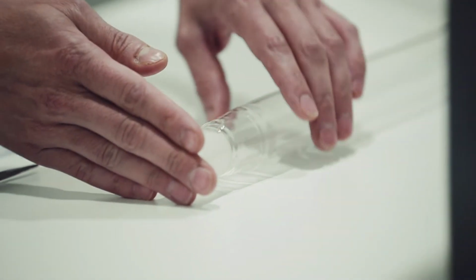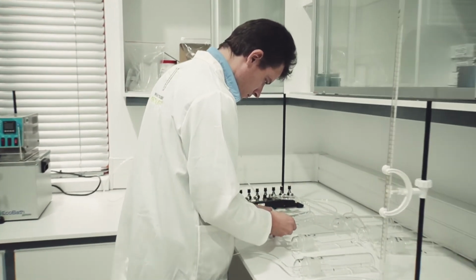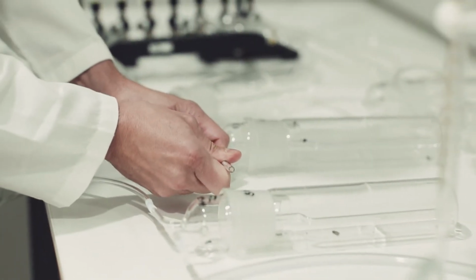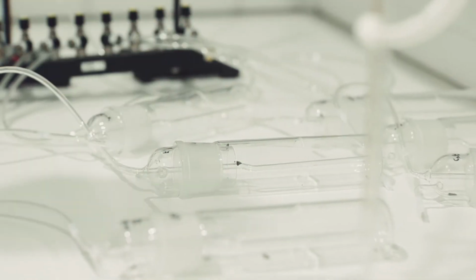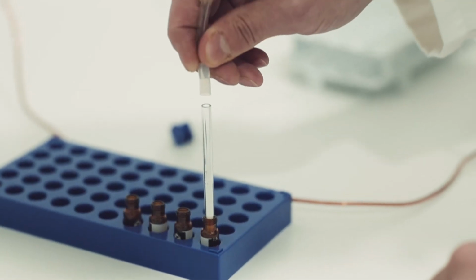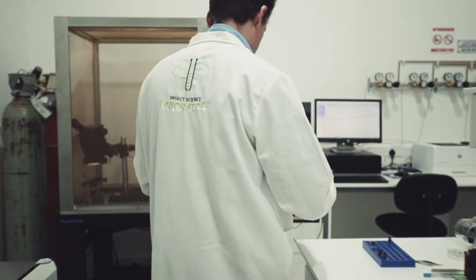So the way we do this is we observe what the insects do. Once we find evidence of a pheromone being present in that system, we then sample the insects. So typically one would take the insects and put them in a dynamic headspace sampling facility, and then the volatiles that the insects produce are then captured on adsorbent material like Poropak Q. These samples are then desorbed, so we use analytical solvents to extract the Poropak, and then samples are generated which are then analyzed on the gas chromatography machine.